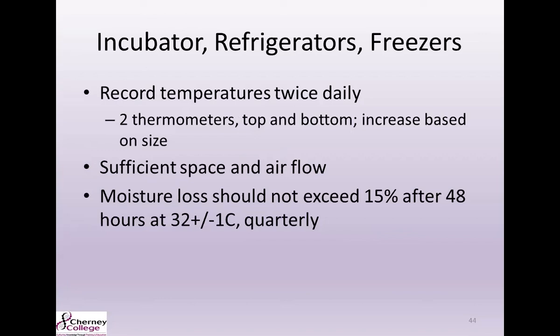For incubators, refrigerators, and freezers used within the lab, it's recommended that you record temperatures twice daily. Utilize 2 thermometers per incubator or refrigerator or freezer, a top and a bottom. And you can increase the amount of thermometers based on the size and space of your incubator.